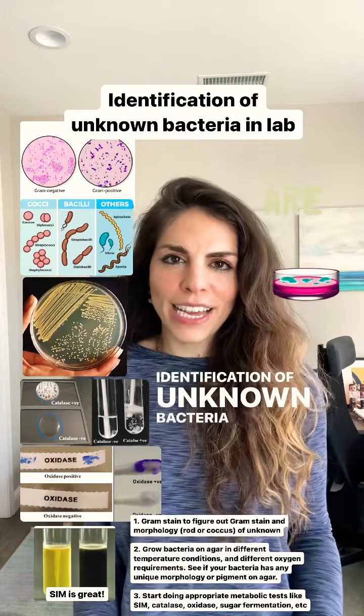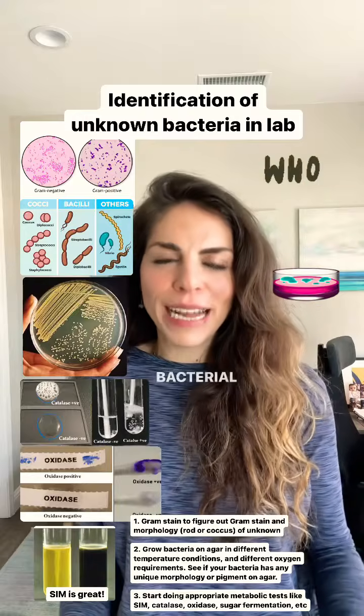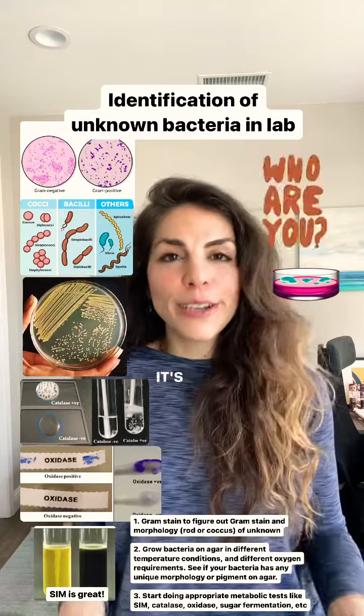Identification of unknown bacteria in microbiology lab involves multiple steps and tests to narrow down the possible bacterial species. The order that I would follow is first I would do a gram stain. It's a good initial test.